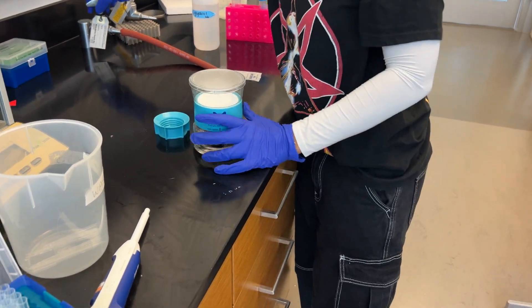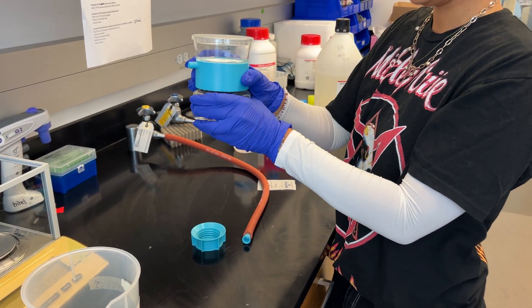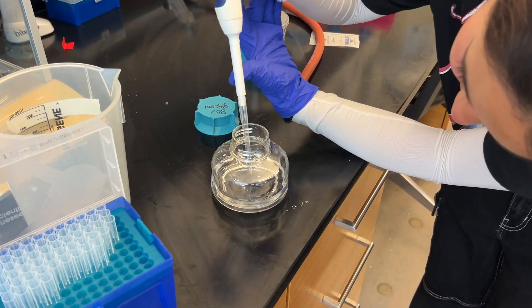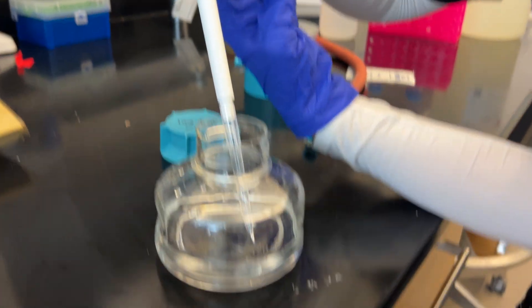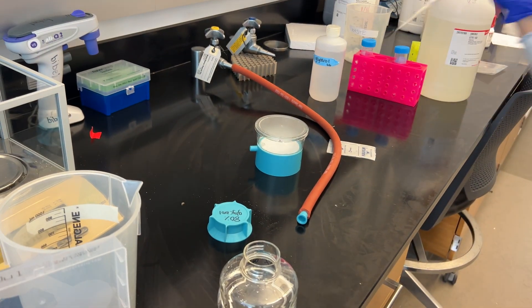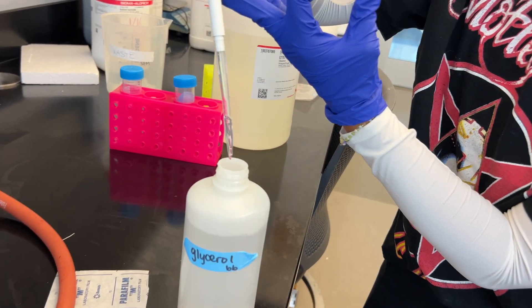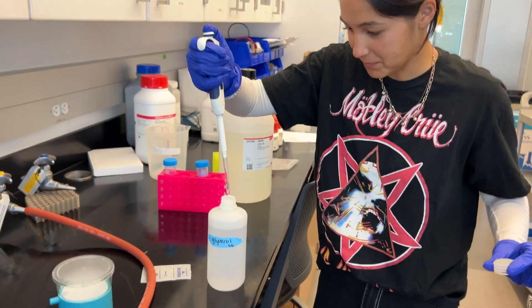Now we can do a test comparison — try this 80% versus the 100%. Look how easy that comes up! Now try the 100% — get a new pipette tip. Oh, what a mess! It's like impossible. Undoable. So 80% glycerol is the way to go, guys. For the win.